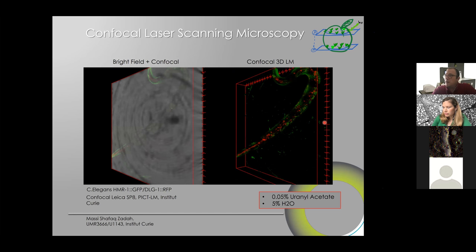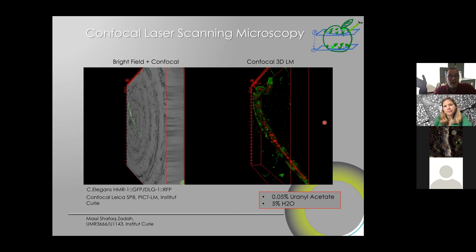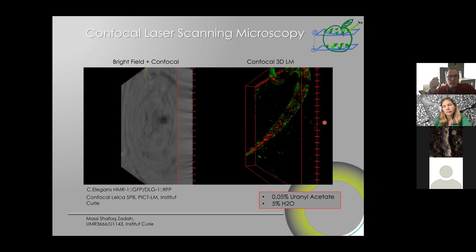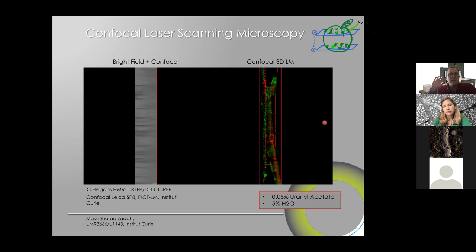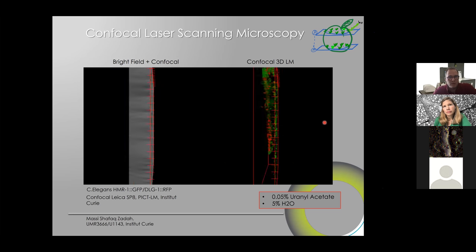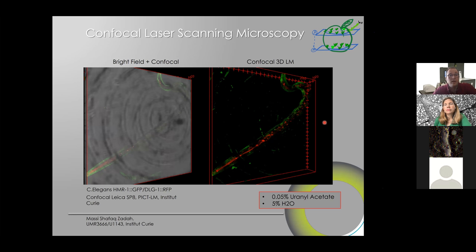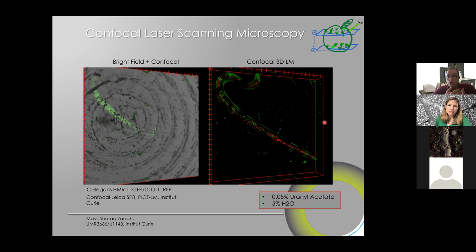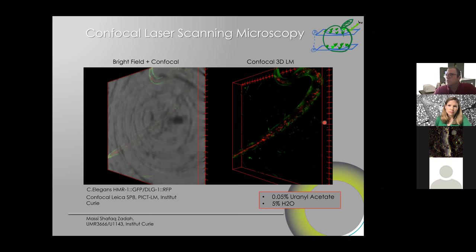Not only did it give very nice results, but we did not observe any bleaching, and it did not alter the structures underneath afterwards. This block was imaged at the Curie Institute, and then I sent it to Chris so that he could do the volume electron microscopy. So that he could get familiar with the block, he went back to an epifluorescence microscope, and he could image the same worm and look at it again. And he was not looking for the fluorescence. It was not bleached, and we were using, again, a huge amount of laser power.